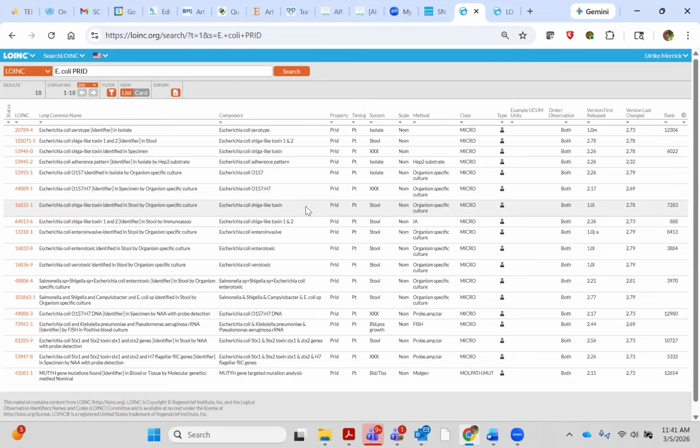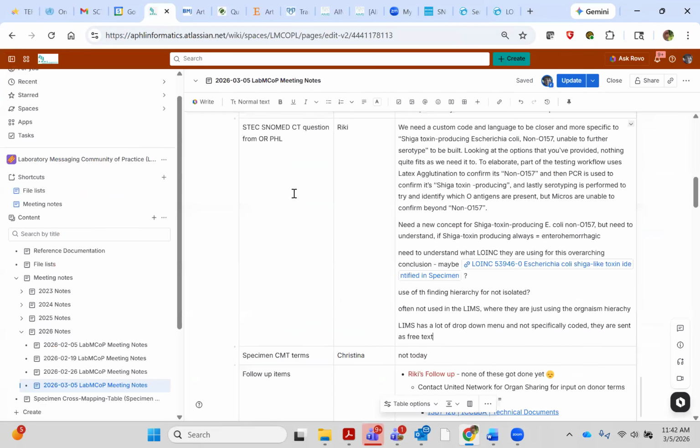The other thing that I think is a major issue is that historically there are multiple vendors that consider, as you're going through this isolation and identification of the organism and adding on these tests, that they don't model them the same as other tests. This occurs in micro and blood bank, and they consider them, quote, workflow steps.